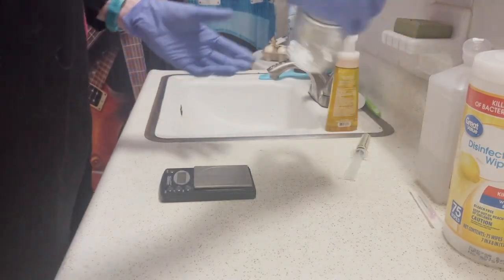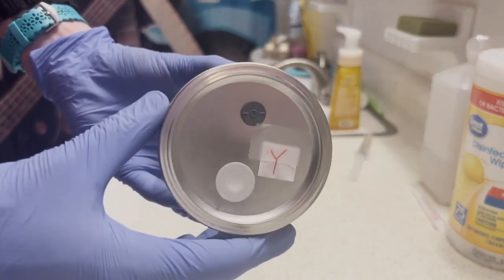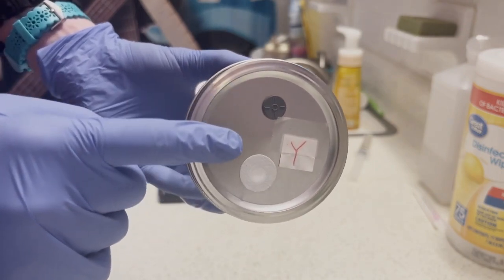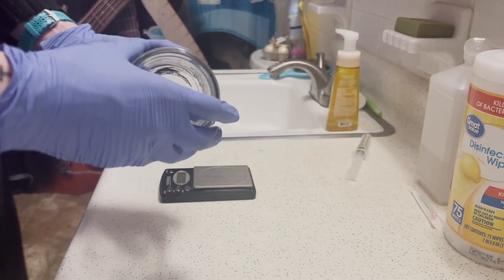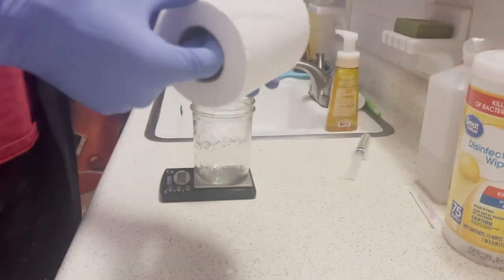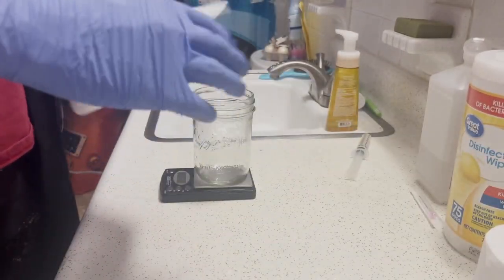I'm going to start by measuring out 15 grams of corn syrup. You can see my modified lids here — I have two holes drilled. One is a self-healing silicone injector port and the other is a 2-micron filter. The 2-micron filter is good to fight against airborne contamination, but once you put it into the pressure cooker, steam can still get in there, so that's something to note for later.